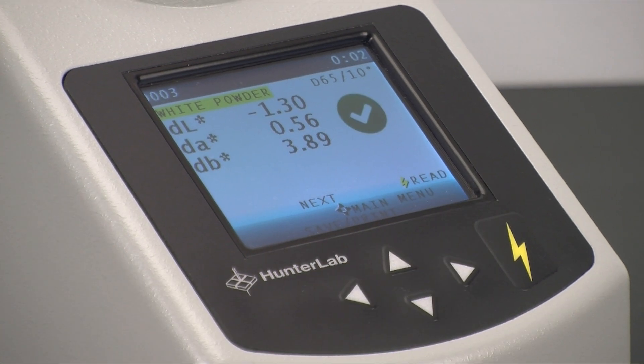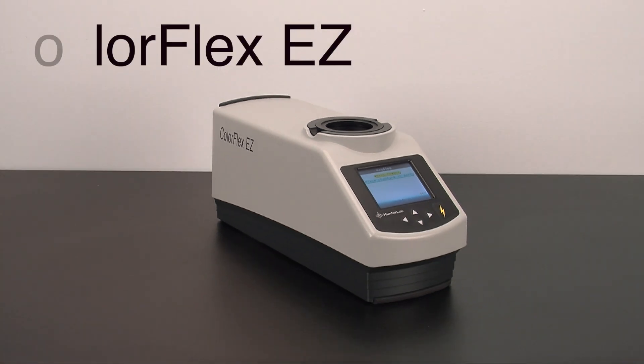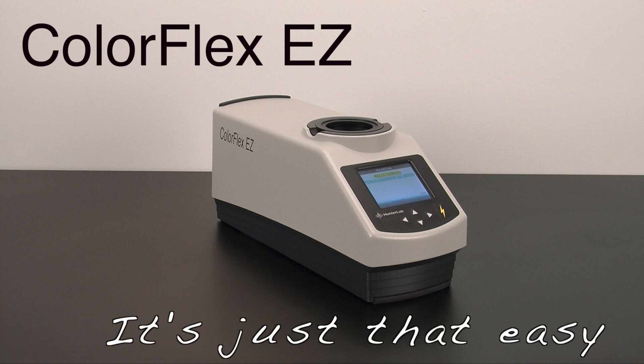While having different measurements, each are within the acceptable range for this particular product. The ColorFlex EZ — it's just that easy.